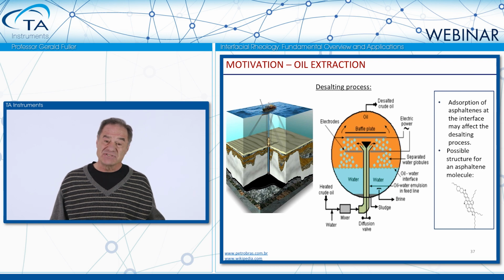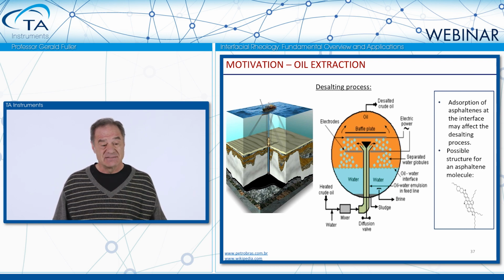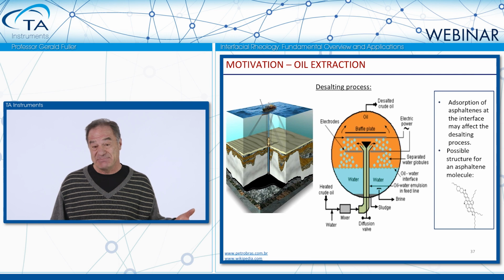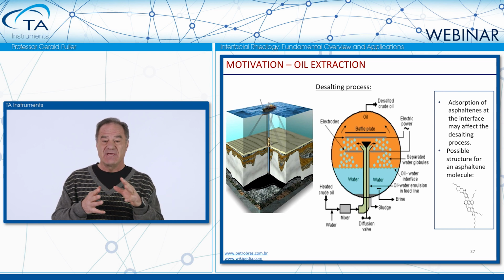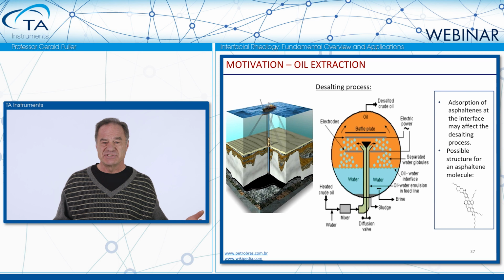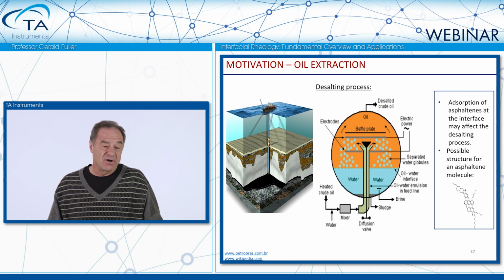It has the appearance of a surfactant. In fact, it really is. It does have surfactant-like character. These are classified through a very crude analysis, solubility. These molecules are soluble in toluene, but insoluble in heptane. So you can extract them conveniently from oil, and you'll get a black residue that you can then resuspend for the purposes of experiments, as we did in our case.